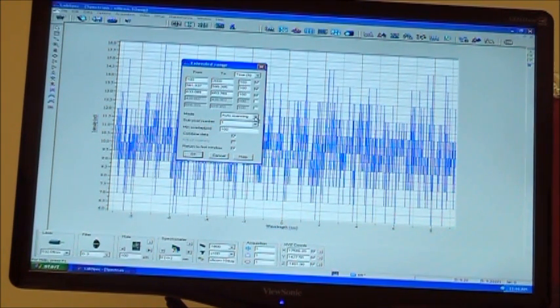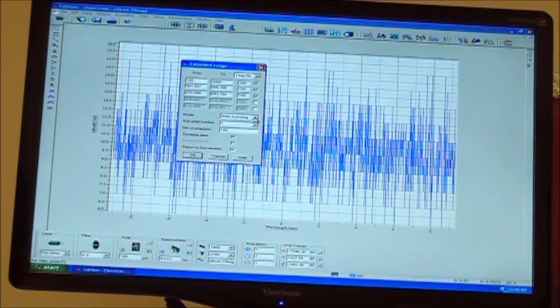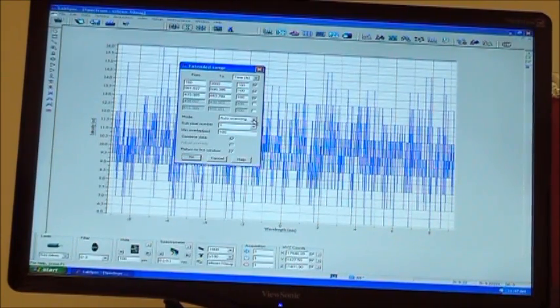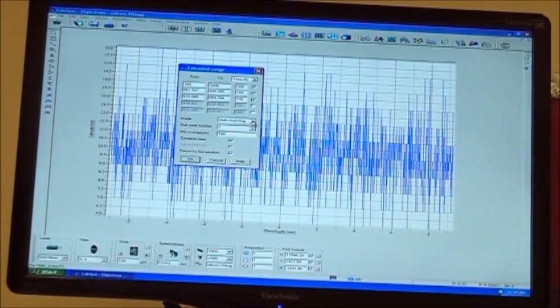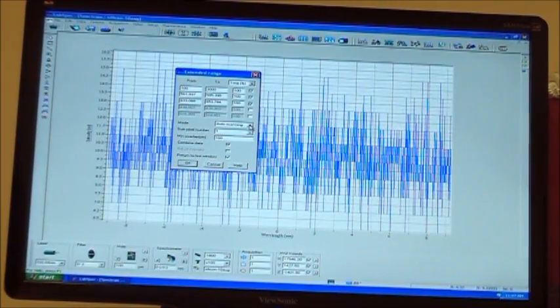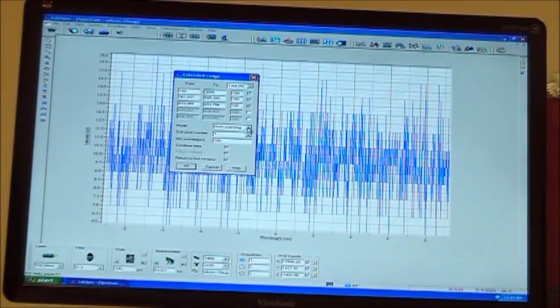So in a single shot you can see 500 pixels. So for example, the first scan will go 0 to 500. You see that in a single shot. The second scan will go 400 to 900. Because then it'll leave those 100 pixels in the middle to overlap to help even out your baseline and your data as it stitches it together. Because it needs a point of reference.